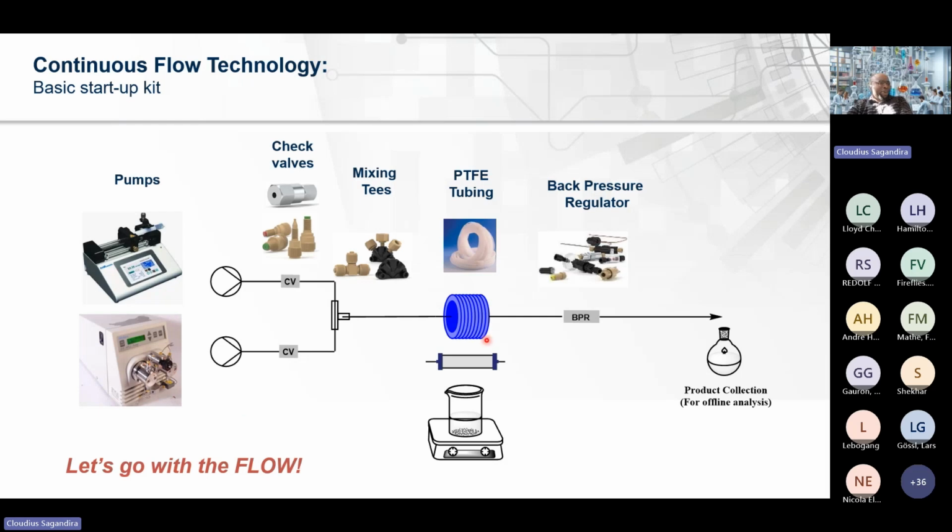I know some people come from a medchem background. Imagine if you can easily synthesize a library in a day, 1,000 compounds, 100 compounds, using this technology. It will be massive. And here is just a link where you can buy all these small things I have just mentioned.